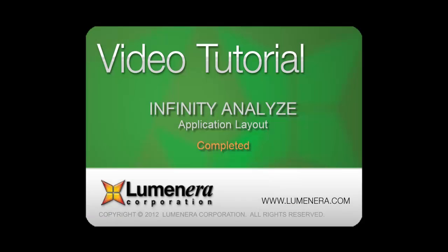That concludes the video tutorial on the Infinity Analyze layout options. Take a look at any of the other video tutorials in this series for additional information.